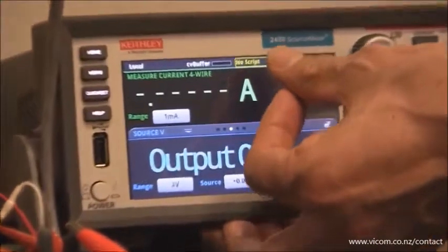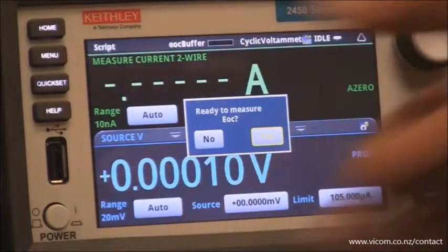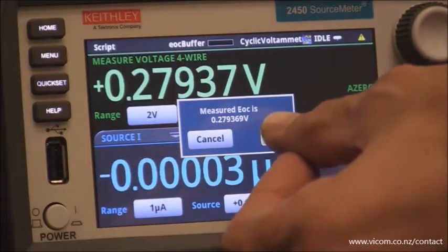To run the experiment you simply go up here where it says no script, push the button, and you'll see all the scripts that are loaded into the instrument. All we do here is select the cyclic voltammetry script. Ready to measure the open circuit voltage? Yes, and that's acceptable.